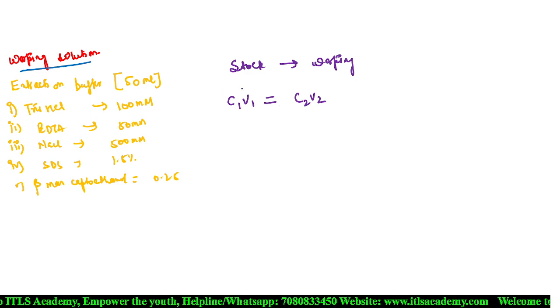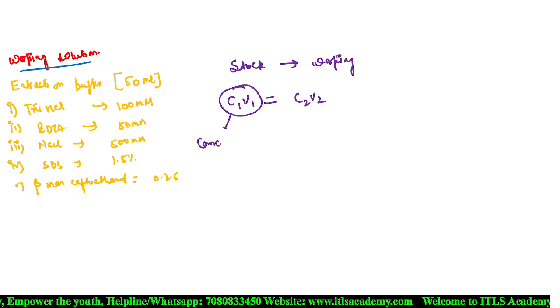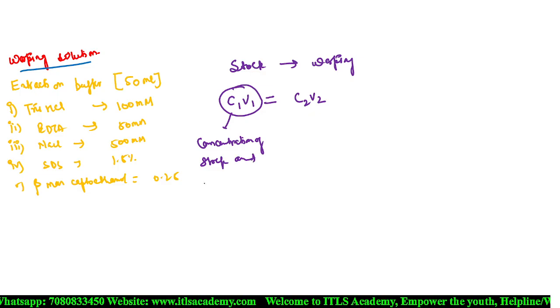Now C1V1 is what? The concentration and volume of the stock.